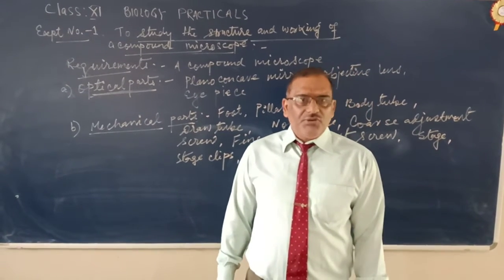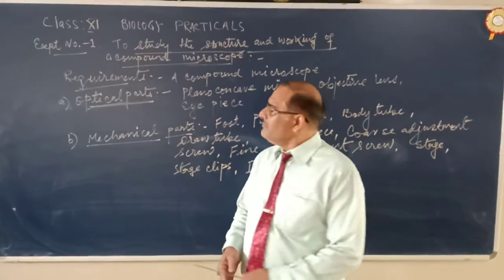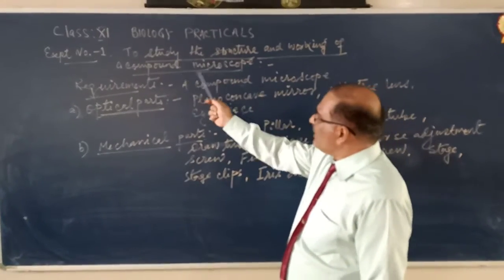So let us start the practical part of class 11. Today we are going to discuss the first practical. The first practical or experiment will be to study the structure and working of a compound microscope.